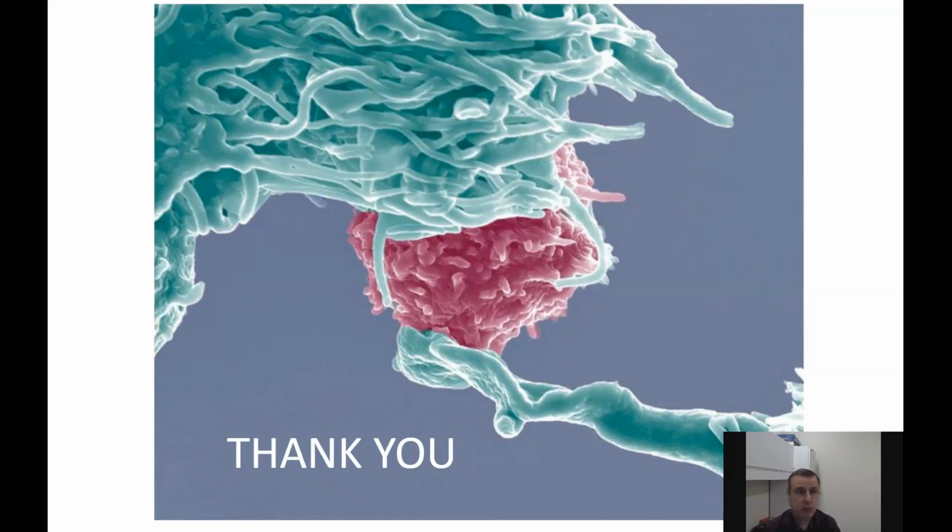Which is why I think we're at an inflection point in terms of interest in protein biomarkers again. After all the work in genomics, now people can take a look at the circulating proteome in a new way that actually is scalable. By that, I mean from the point of view of finding new markers, in terms of so many markers still yet to be characterized.